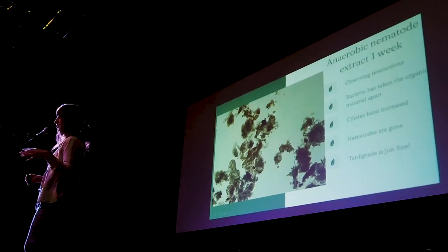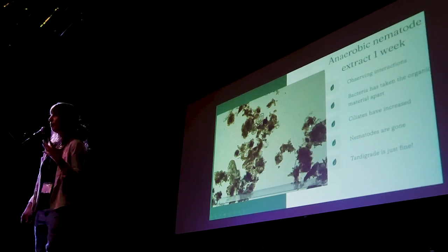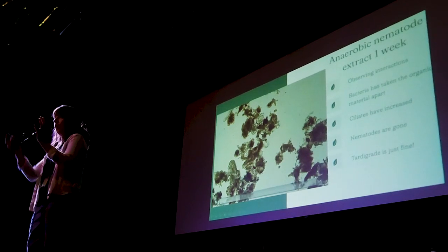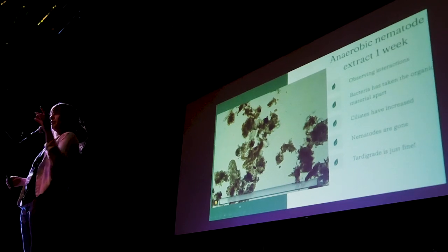Probably don't want to see root feeders, but 1 or 2 isn't going to be the worst. But a nematode extract is a way to take a handful of your soil or a larger amount of your soil and look at all of the nematode life that's present in it.